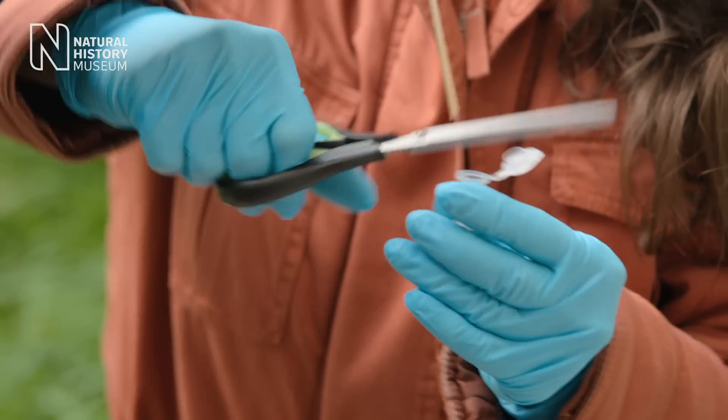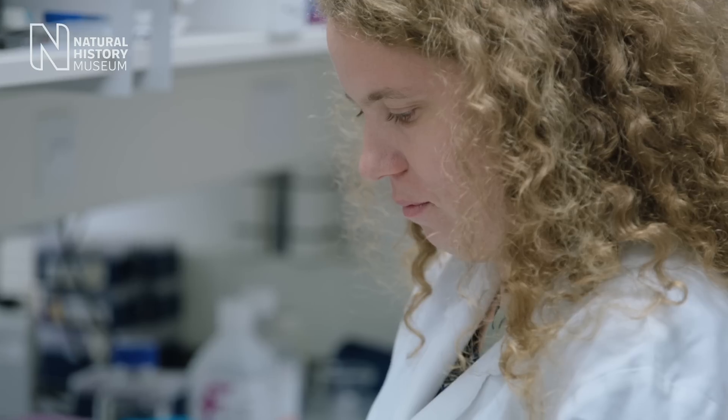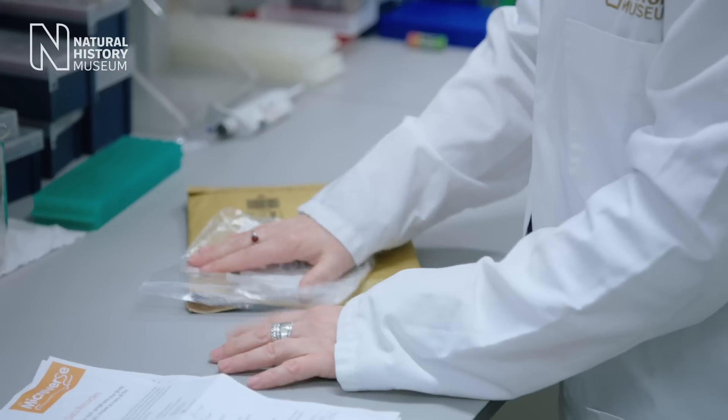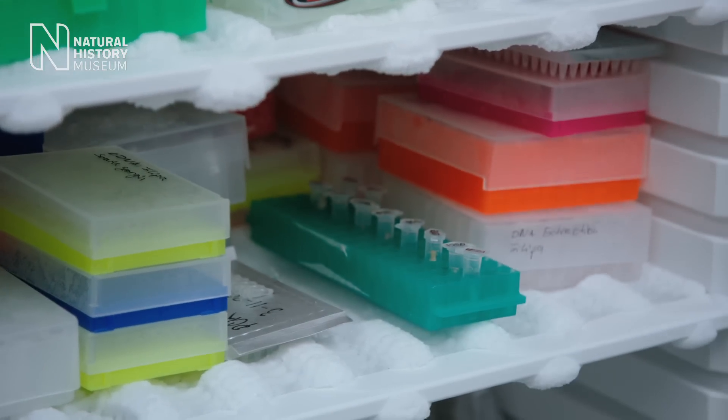When the samples come back to the museum, the lab component of the project will start. The first thing we do is put them in a minus 80 freezer so that the whole samples get frozen and the DNA is preserved.